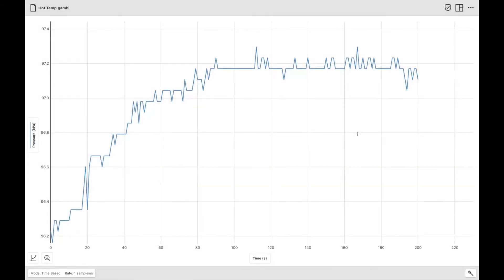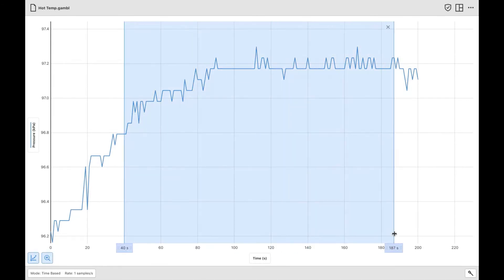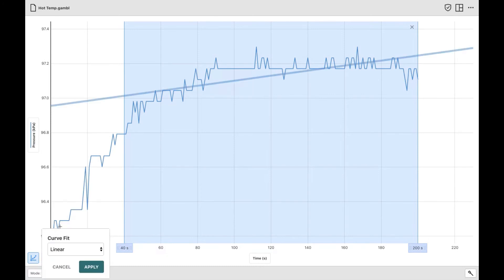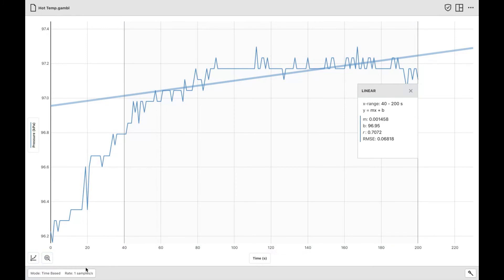We compared the cold and baseline data. Now we're going to compare the hot temperature and see which had a faster rate of reaction. We're going to choose from 40 to 200 seconds, go to the graphing tool, apply the curve fit — it will default to linear again — hit apply, and look for the m value on the side, which is the slope. We'll compare that slope to the cold and the baseline to see which of the three had the fastest rate of reaction.